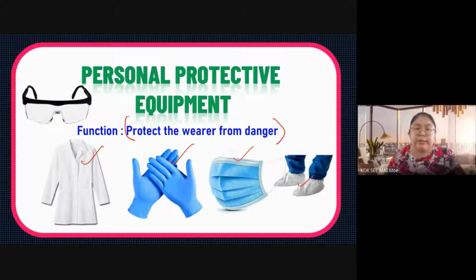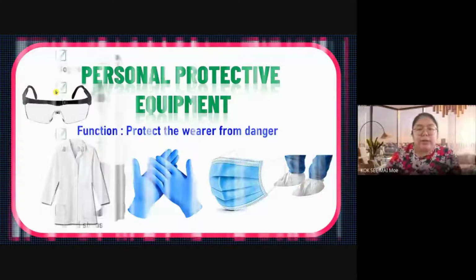Okay, these are some simple ones. This one covers your eyes, the goggles. So this topic is just simple, just to introduce what is in the lab, and also to help protect yourself. Okay, now we go to the next one.